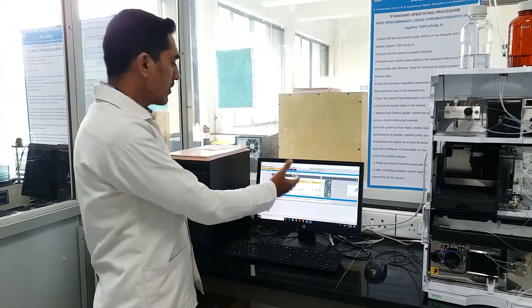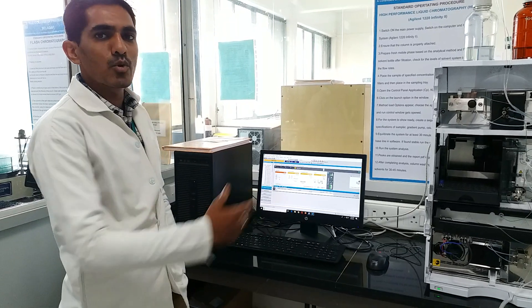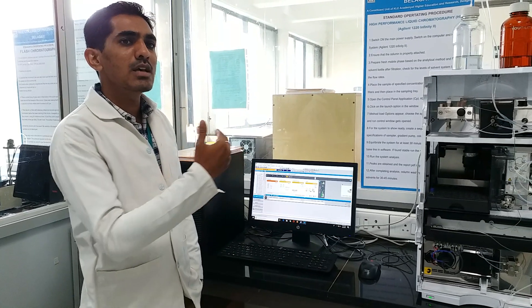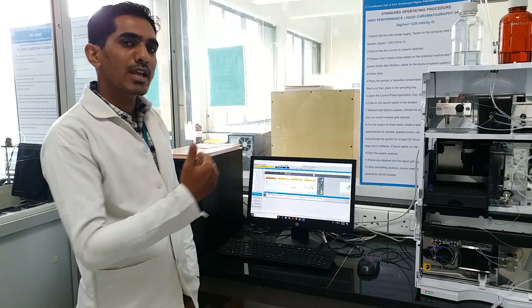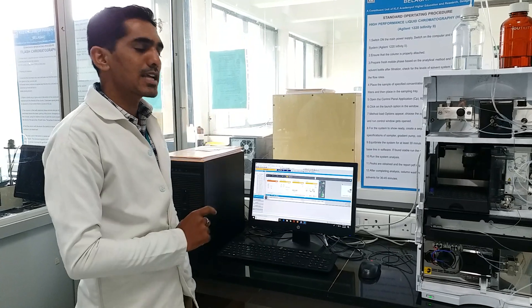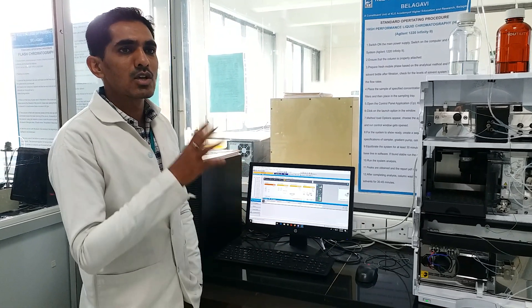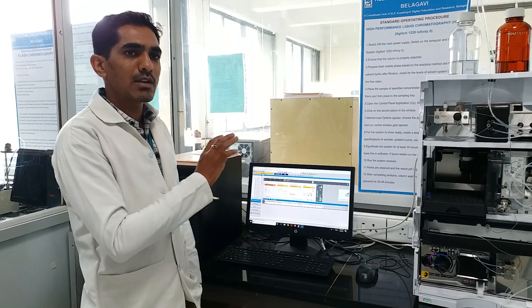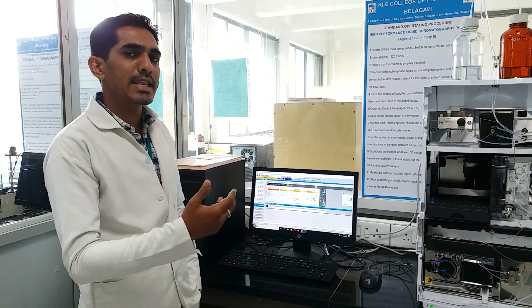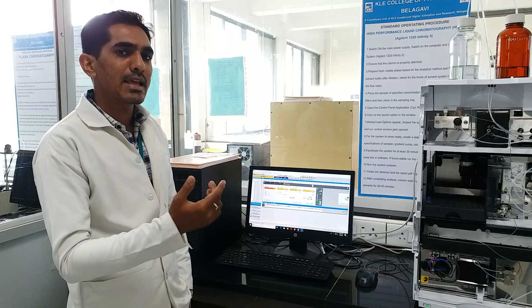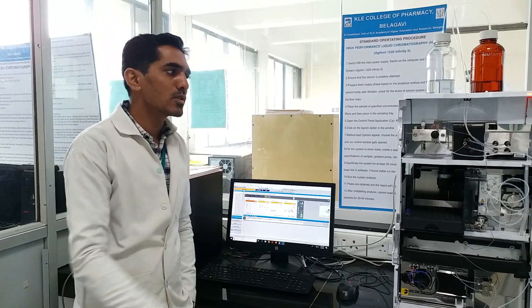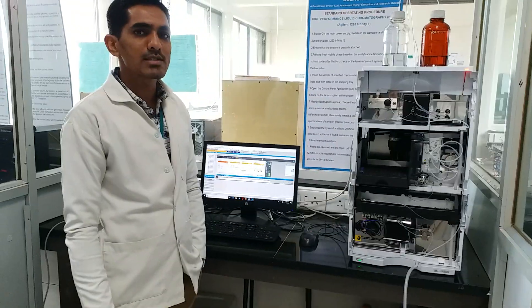Once the analysis is over, we can analyze our sample in the data analysis section and a report can be generated. Once the chromatogram is generated, it can be utilized for qualitative and quantitative applications. In the chromatogram, we have different parts: the retention time (RT), which plays a very important role for qualitative analysis — it tells us whether a compound is present and what its retention time is. For quantitative application, we calculate the area under the peak in the chromatogram. So this is overall about the HPLC instrument as we have in our college. Thank you.